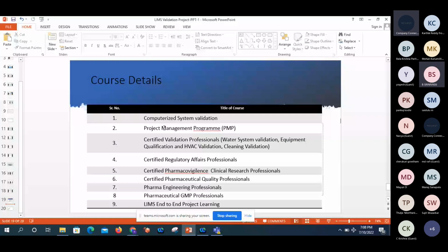Okay, sir. We already discussed these test cases in our basic CSV course on these topics. Sir, actually every software has two audit trail logs: one for user login and logout, and the activity log, which is different.